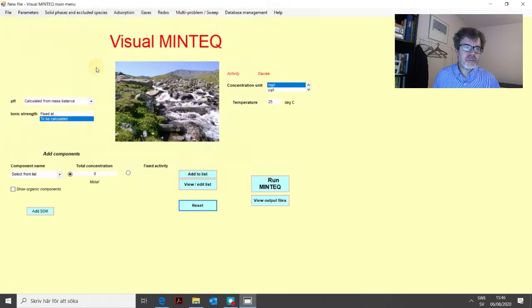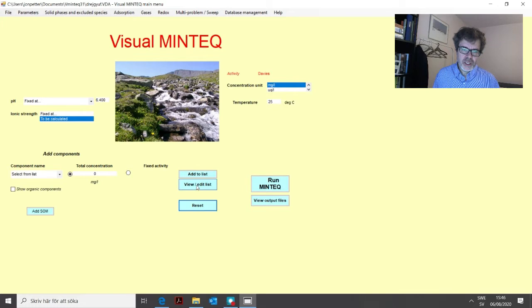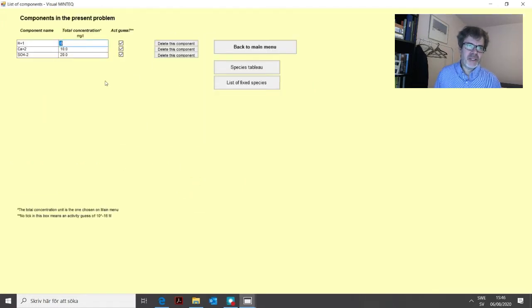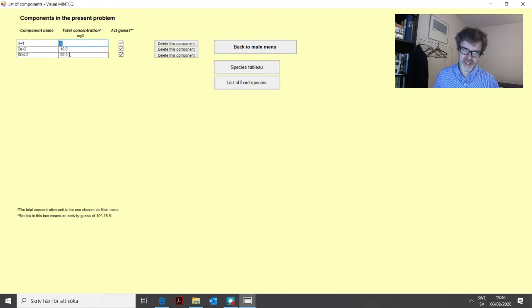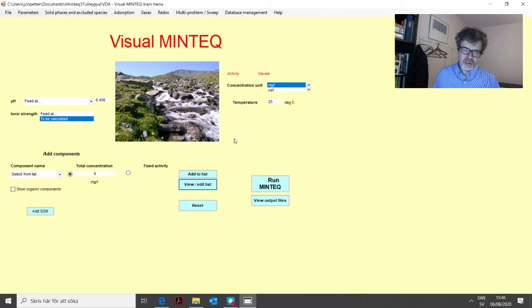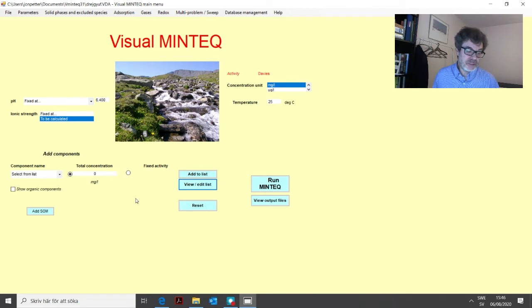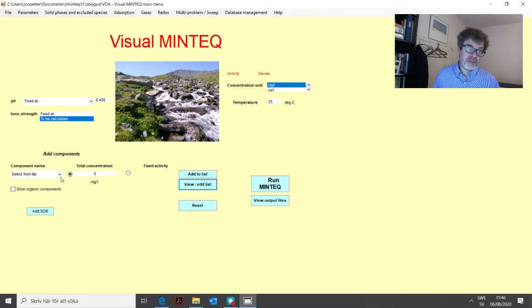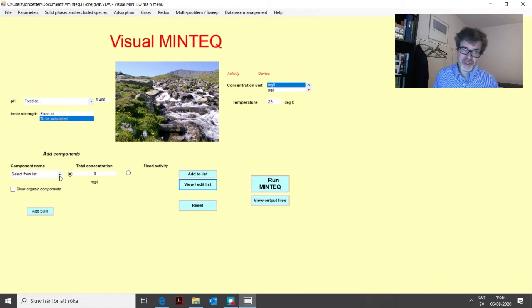This is the one that we made. We have the pH of 6.4. If we click this view edit list, you can see that we defined calcium 10 milligrams per liter and sulfate 20 milligrams per liter. Carbonate can be determined as carbonate or as carbon, for example using a TOC analyzer where you get an input in the form of DIC, which is dissolved inorganic carbon.